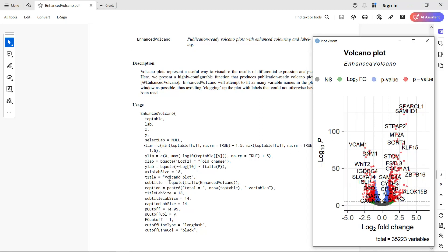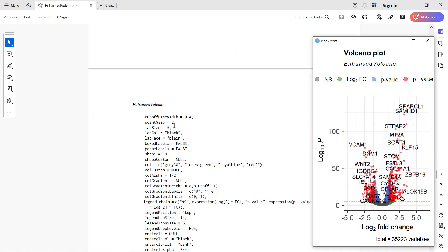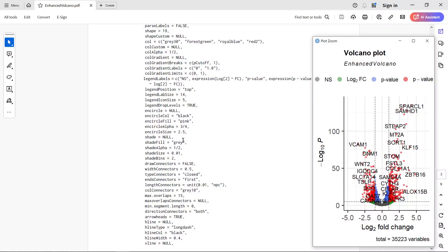The default title is 'Volcano Plot' and it also has a subtitle called 'EnhancedVolcano' in italic. There are arguments for title and subtitle label settings. The p-value cutoff is 10 to minus 5, so that line appears at 5, and the FC cutoff is 1, giving lines at minus 1 and 1. You can also adjust the cutoff line type, cutoff line color, cutoff line width, point size, and label size. I'm going to show you some basic changes in RStudio.